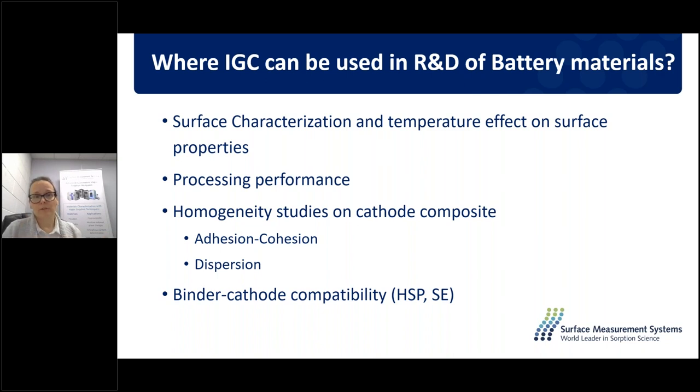And it's very, very important to see how big this difference is. You can also get with the IGC system, from the surface energy, adhesion, cohesion, and dispersion properties. You can predict how compatible the dispersion behavior is, and finally also binder cathode compatibility. That is what you can also determine with this IGC system that we have.